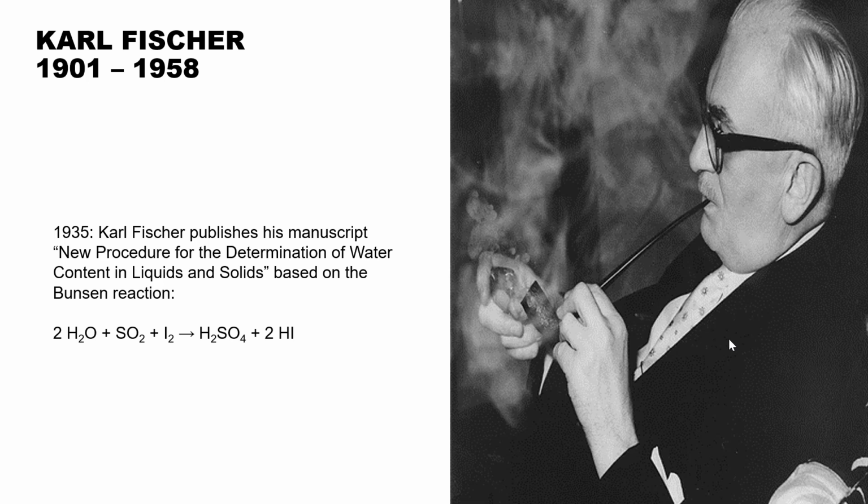He actually discovered that he could modify this reaction to determine water content in a non-aqueous system that would contain an excess of sulfur dioxide. In his very first reagents that he created, he used methanol as the solvent, still commonly used today, and pyridine as the buffering agent, as he discovered that this reaction is pH dependent.